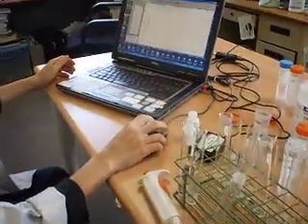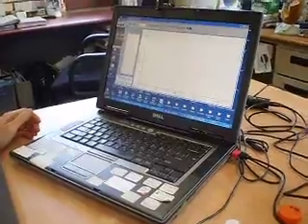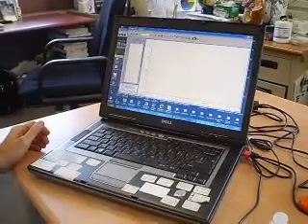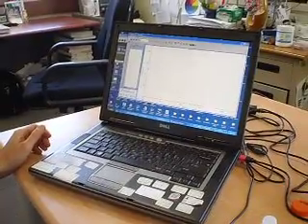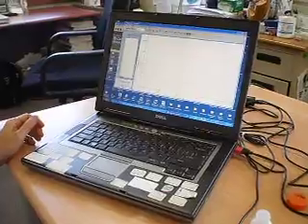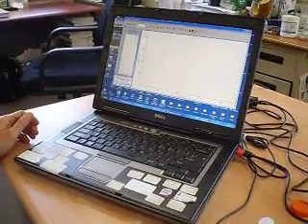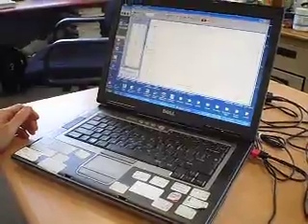Before I start, get into experiment, store my latest run. So this is my latest run, measuring the rate of reaction for my first run, which was at 1.5%. Now it's for 0.75% hydrogen peroxide. So that's my next one. Click on collect before the reaction starts. So I let it run. I know that atmospheric pressure is at 101 kilopascals before the reaction starts.